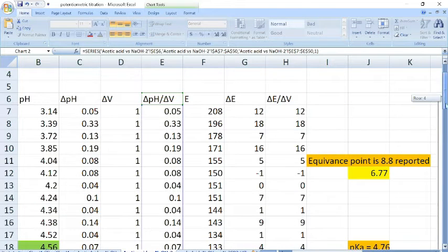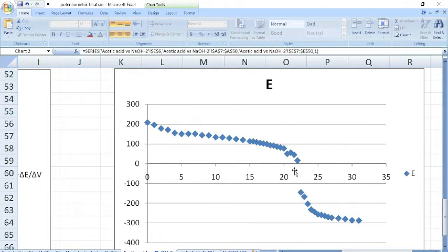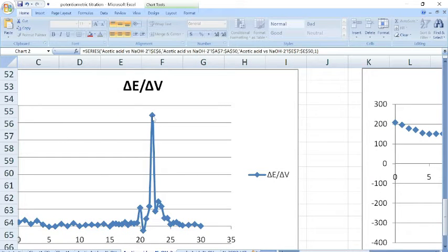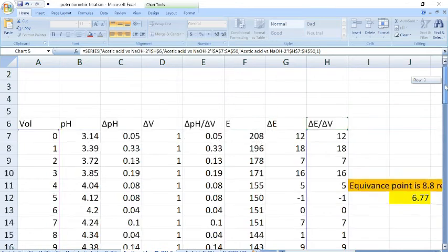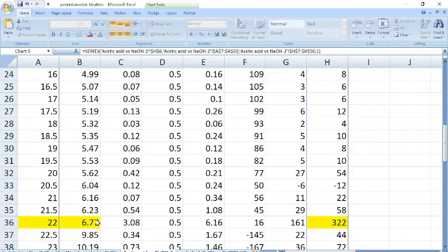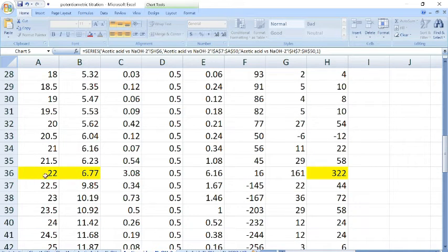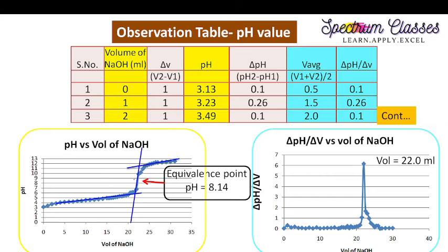I also draw the graph of potential versus volume of NaOH. This graph crosses between negative and positive values, passing through the mean axis. From the derivative of the potential graph, we can identify the inflection point. At the same point — 22 ml — we get the inflection point from both graphs. The equivalence point is therefore at 22 ml, with a pH value of approximately 6.77.